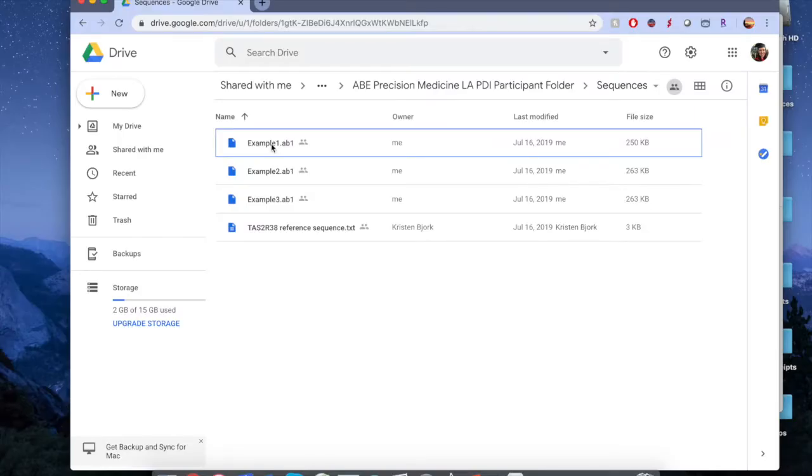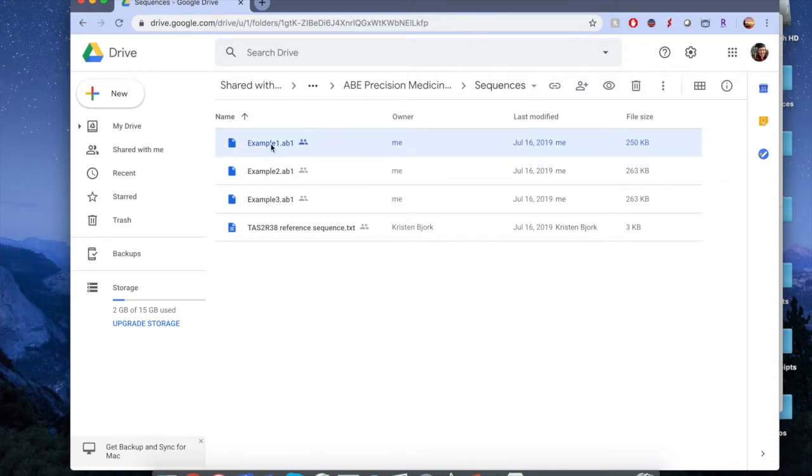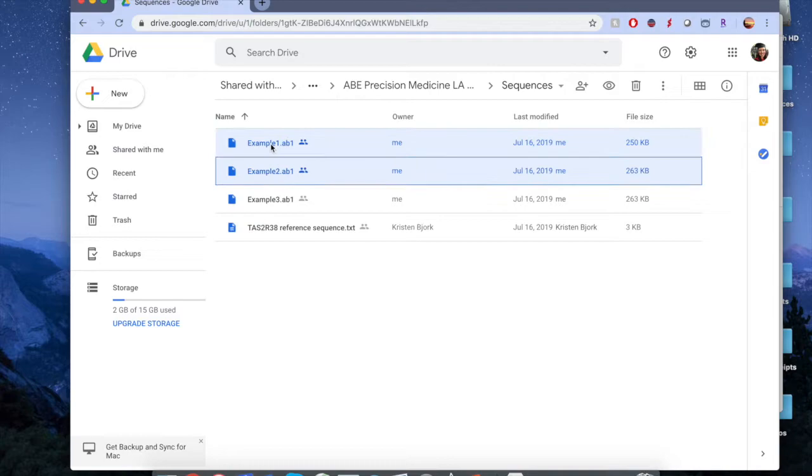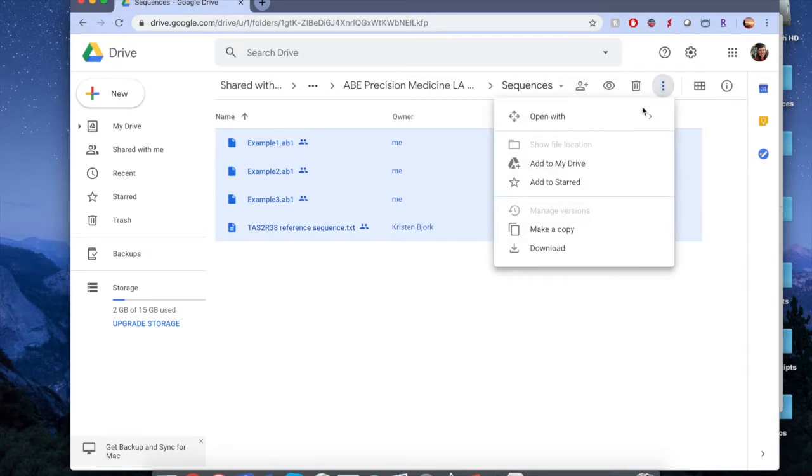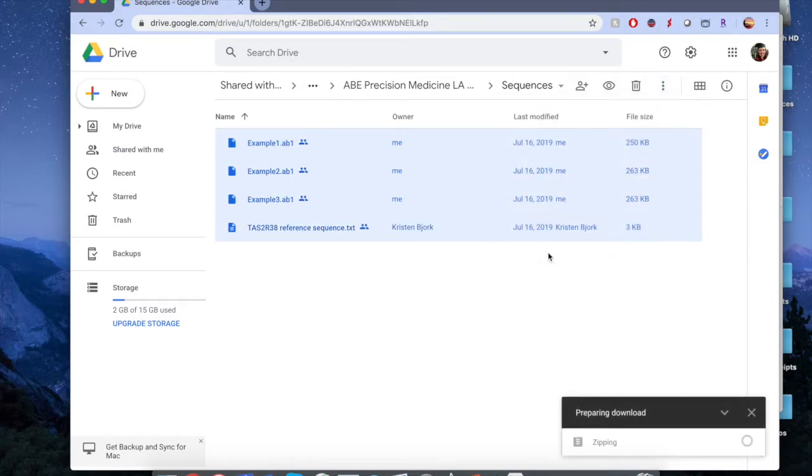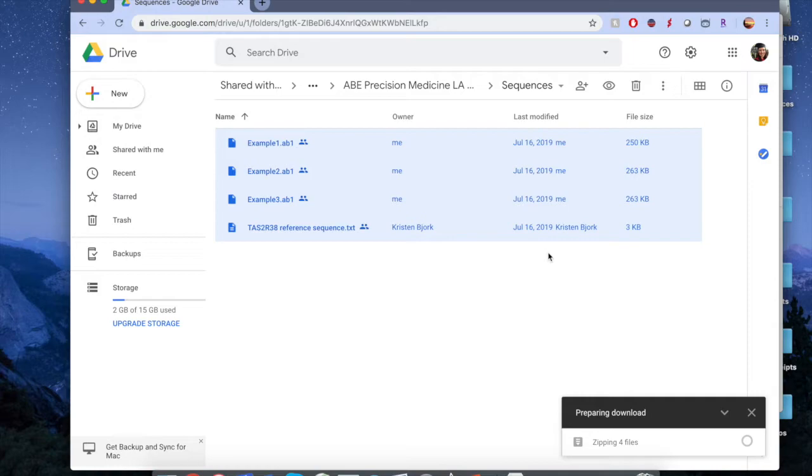To begin your analysis, access the participant folder on Google Drive or wherever your sequences are stored. Select the four files and download them as shown by clicking the dot dot dot button and then selecting download. You'll notice that three of these say example and one says tas2r38. This last file is the reference file to which we'll be comparing all other sequences in order to find differences. Place these files in a folder in a location where they'll be easy to find, like your desktop.